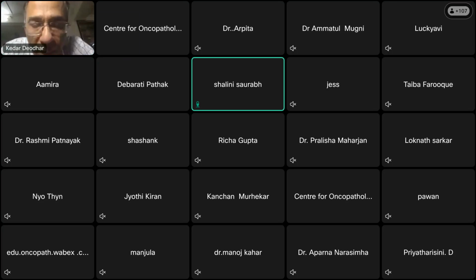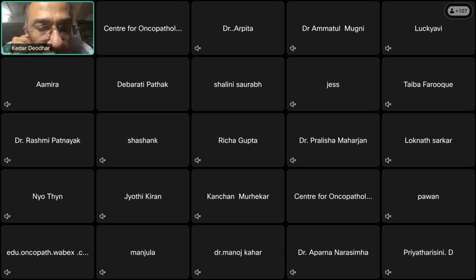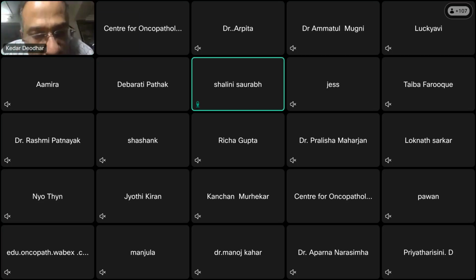So there's another question, sir. Can we differentiate metastatic nodes and normal ones on gross examination? Metastatic node and normal node. Yeah, I think we can have a fair idea.